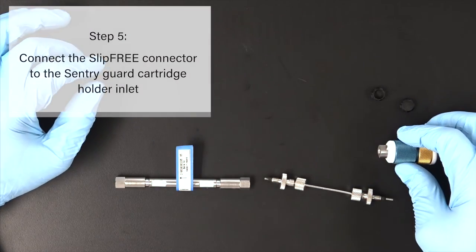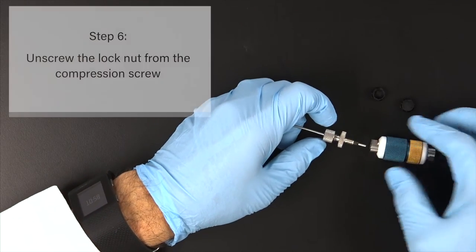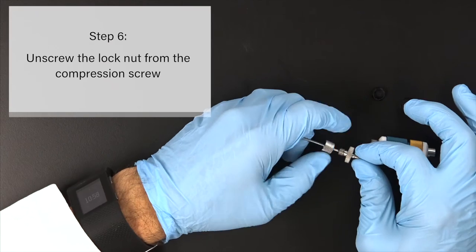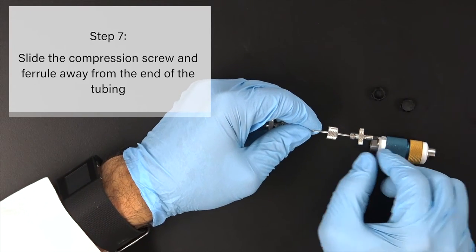Next, connect the slip-free connector to the Sentry Guard Cartridge Holder inlet. Unscrew the lock nut from the compression screw. Slide the compression screw and ferrule away from the end of the tubing.